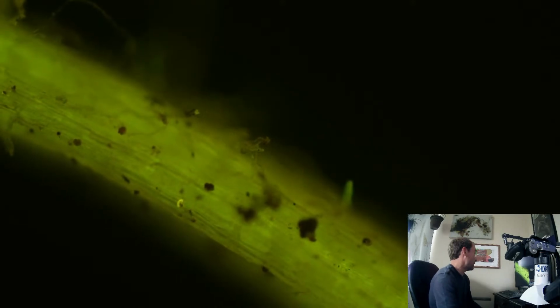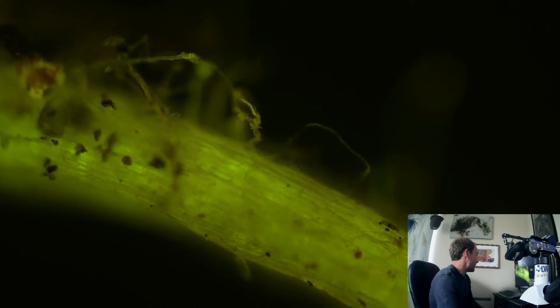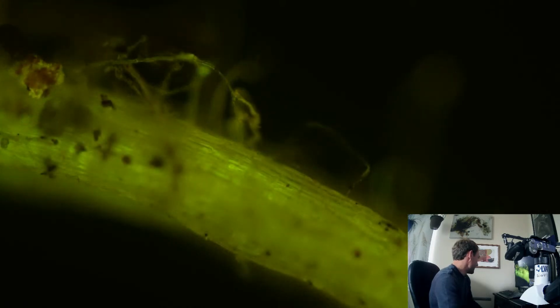Maybe one day we'll have spectroscopy built into microscopy. But we're not quite there yet. That's something that somebody should get into and figure out. We're just learning about one of the biometers that are coming out to detect different stuff.